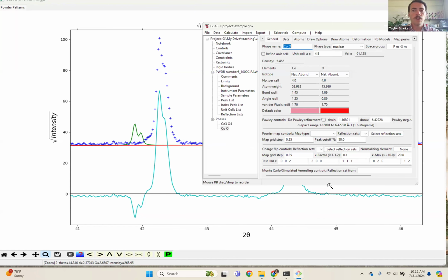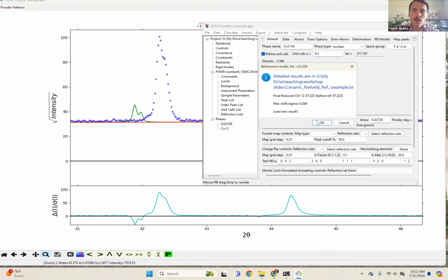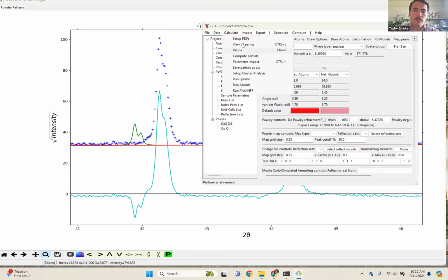Whereas if we did it before, I don't think it would have found it. It's very possible it would have diverged. So let's try it out. Let's try hitting refine on these things and see if it actually moves to the right spot. We only did 3 cycles of refinement, which is not very many. Let's give it the typical 10 that I like to start with.